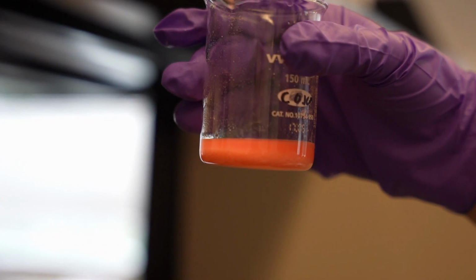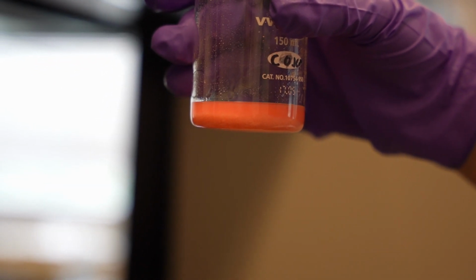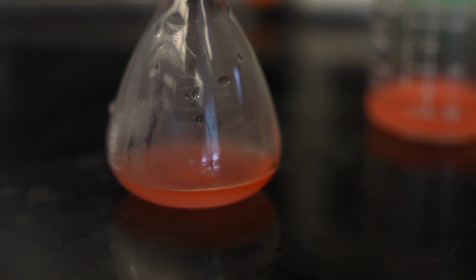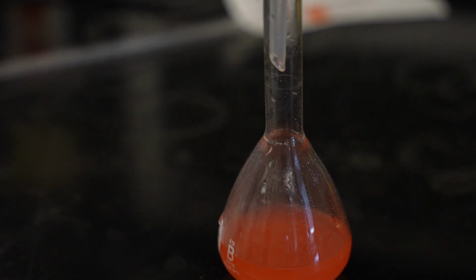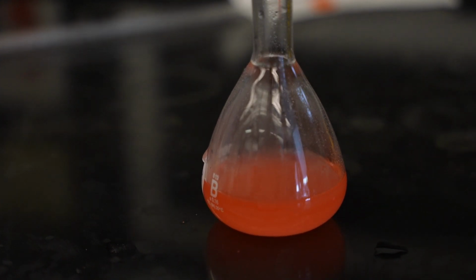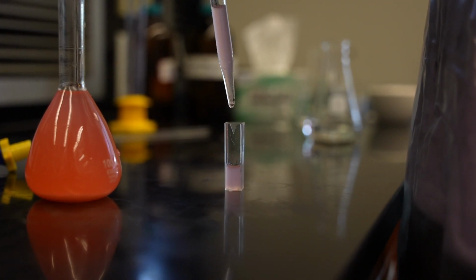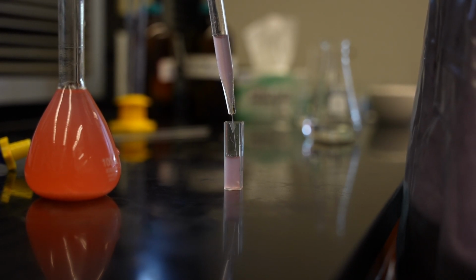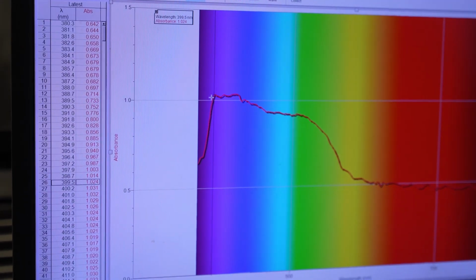In the post-lab, you'll create an absorption versus concentration graph in Excel using data collected within Part 1. This is to measure the relationship between the two properties and see how that connects to Beer's equation using graph analysis. As you graph these datasets, the trend of best fit line, or the slope, should indicate the molar extinction coefficient, or epsilon for short. Epsilon represents how much light a given liquid can absorb, and is an intrinsic property, one that is reliant on the liquid itself for this property.